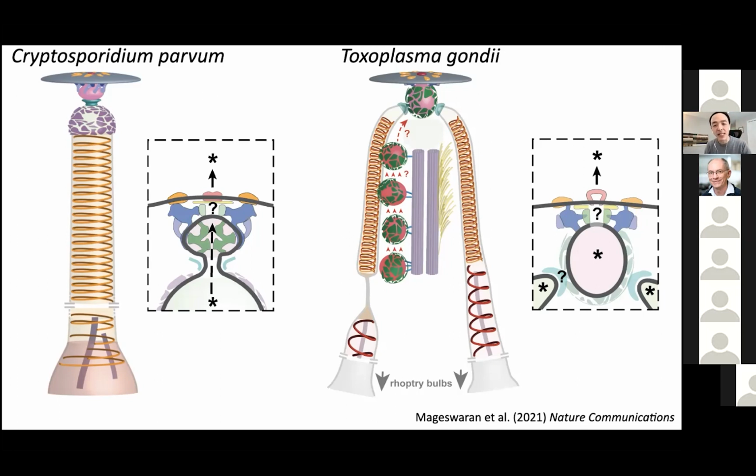And also the filaments inside the lumen, like I said, one possibility is that they are involved in organizing contents in the lumen before and even during secretion. Another might be force generation, how they push those contents through those barriers into different compartments. Those things are still at the stage of hypothesizing, but I think they can be answered if we can image the active invasion events, say by combining cryo-FIB milling and imaging the parasites actively invading their host. So we might be able to provide the next level of structural understanding of this system.